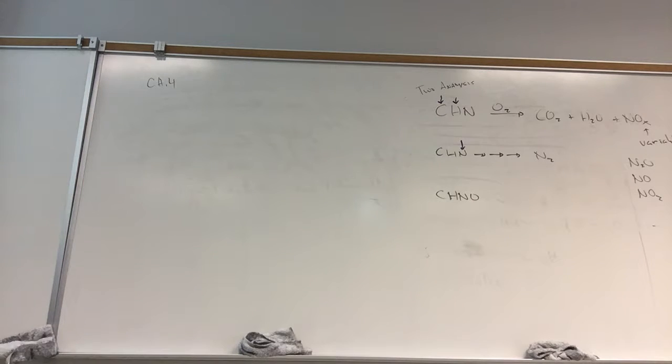This one's called a metathesis type reaction. Here, it's precipitate. This one is a redox reaction. This is a penny and nitric acid. This is another redox reaction. This is combustion of something here. Burning. Wire gauze, steel wool in air.